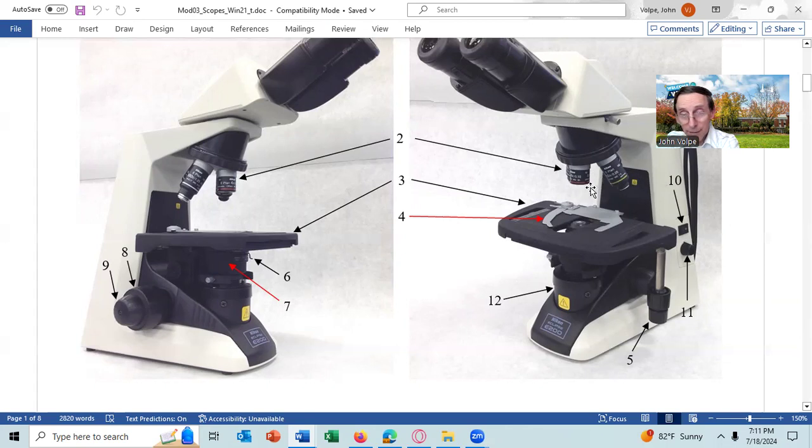objective lens. So in short, when you're starting with the 4x lens, you should have the iris diaphragm open so the cone of light is large, so that the entire field of view that you can see with the 4x lens has a cone of light coming up. And then as you go up in power, you should start closing down the iris diaphragm to adjust the cone of light. So once again, it's to the size of your field of view.